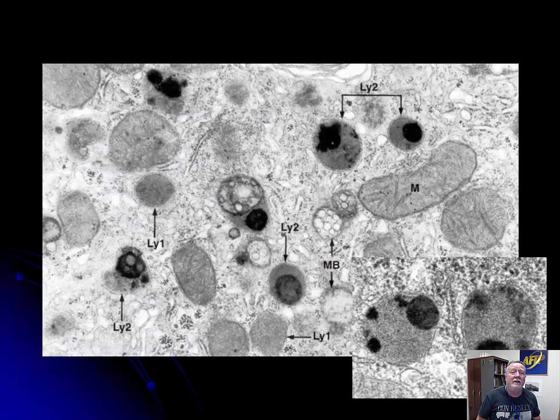Okay, so to this point, I don't think I've given you a single new word for your vocabulary. And for a lot of you, I'm not going to give you any on this. This might be the first time that we put anything new in our vocabulary. And I've told you before certain rules. Try not to interpret anything that's really black. And also don't use words like vacuoles. It grates on my nerves. I will use it once or twice, in a very specialized circumstance, which we have not come to.